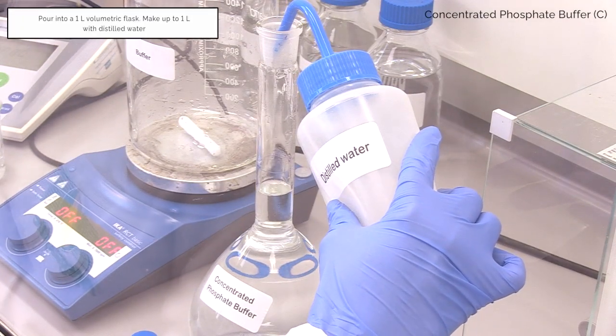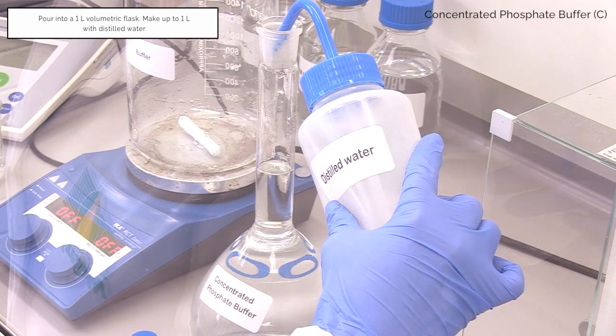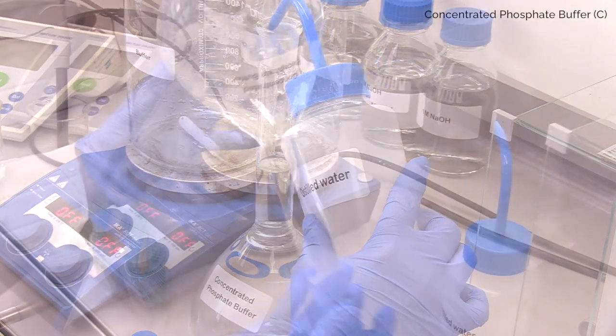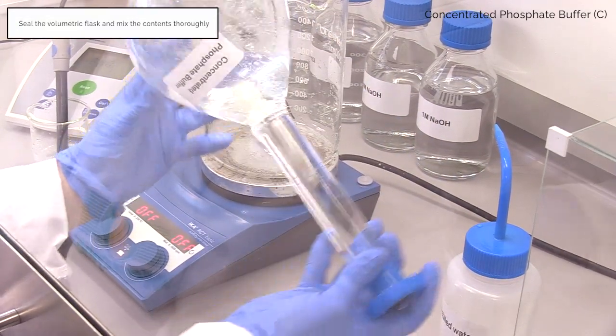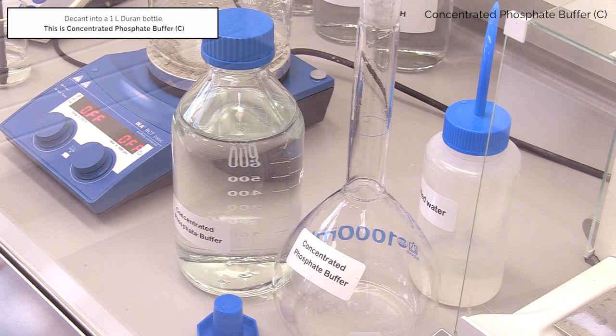Pour into a 1 litre volumetric flask and make up to 1 litre with distilled water. Invert to dissolve. Decant into a 1 litre Duran bottle. This is concentrated phosphate buffer C.